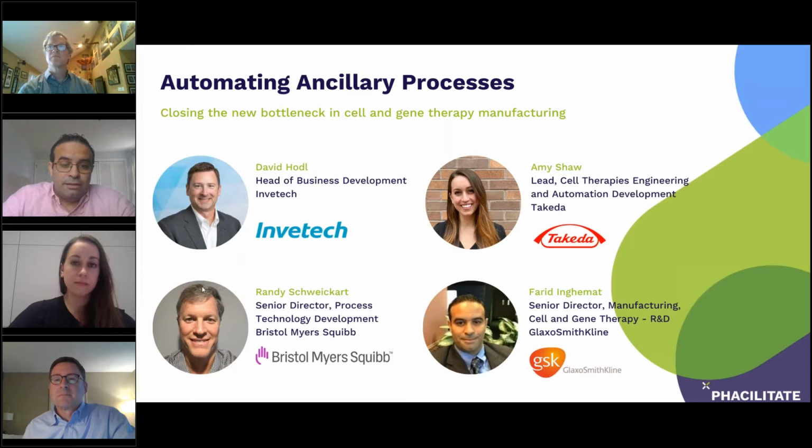The BACT capsule needs to be injected or seeded via a syringe right now, so it forces you to open that process at some point. If there is a way to transfer that material into the capsule in a closed manner, there's obviously a lot of benefit there, including reduction of errors that occur during that transfer. So it's extremely important to maintain that closed all the way until you get to the testing lab. And that's especially important for safety tests: sterility, endotoxin, myco, etc.